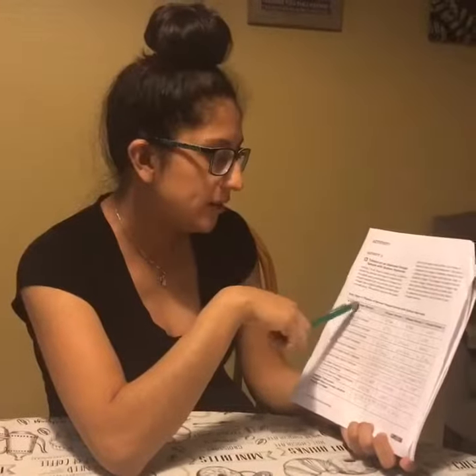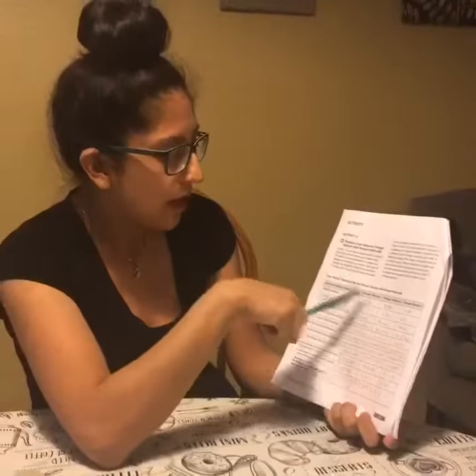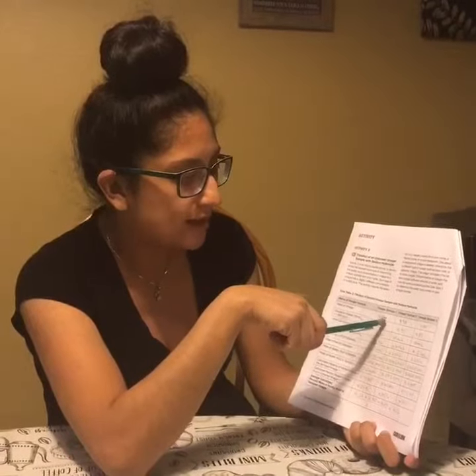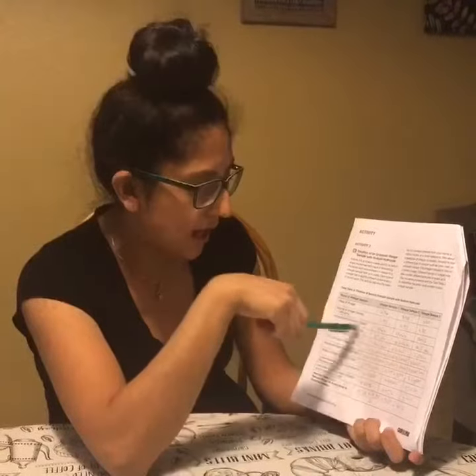For data table number 2, I didn't use the vinegar that came along with the lab kit. I used the vinegar that we had in the household. The mass of that vinegar was actually less than the mass of the vinegar in data table 1. So with this, for sample 1 I got 4.96, sample 2 4.98, and for sample 3 I got 4.88.